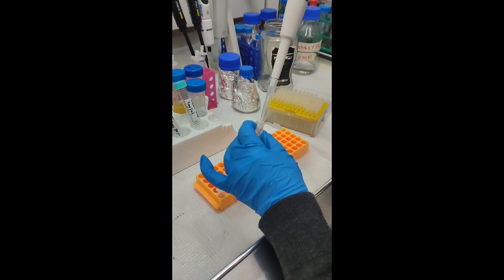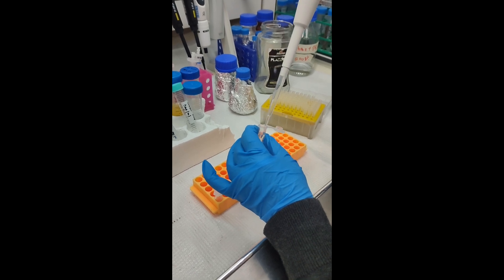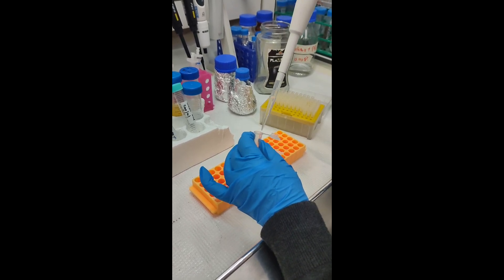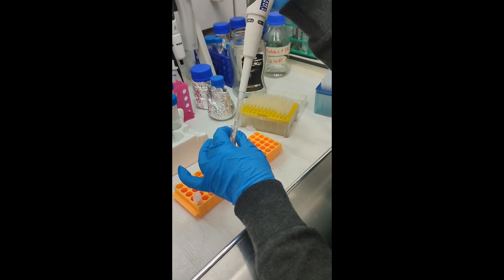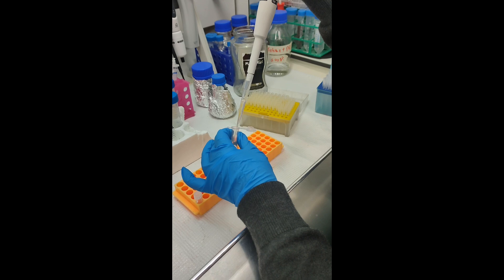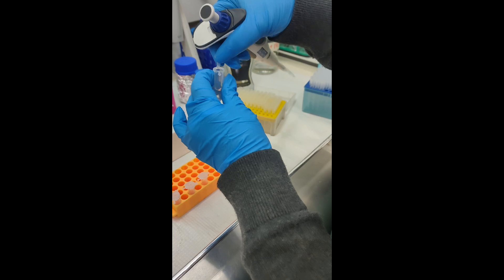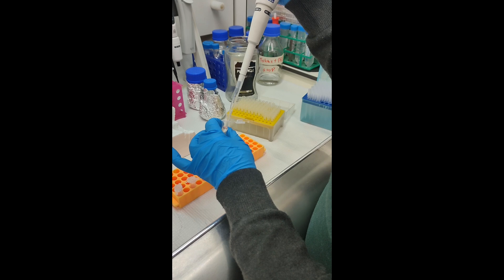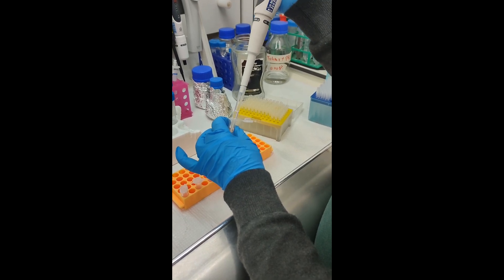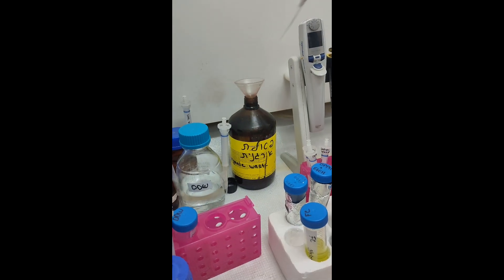Then she is taking from the third tube, pipetting three times and putting it into the fourth tube, mixing again. Then putting it into the fifth tube, mixing again, and discarding the excess into the waste.